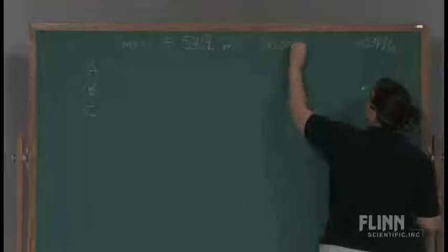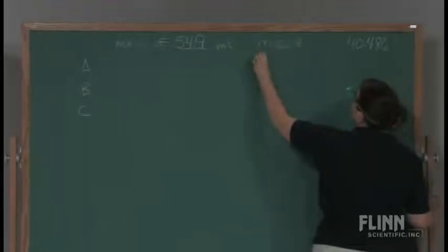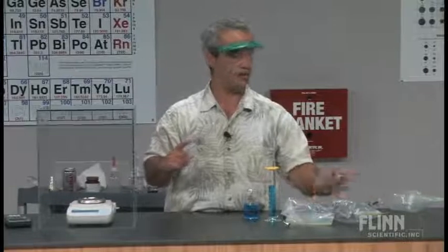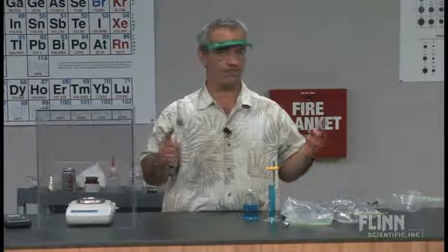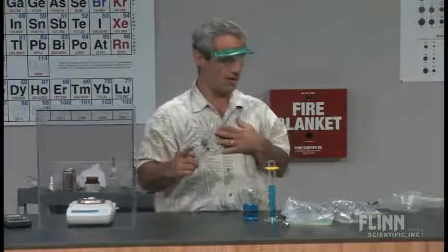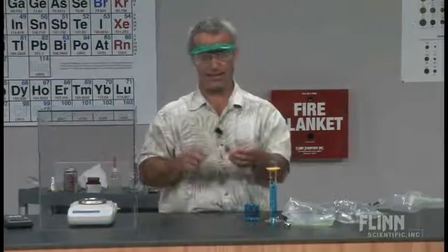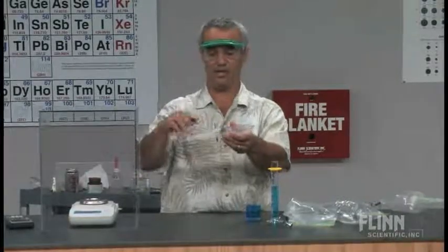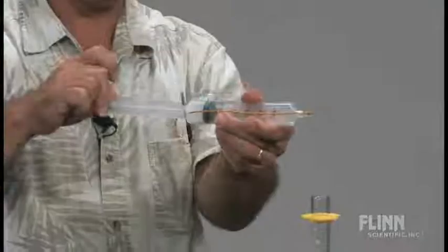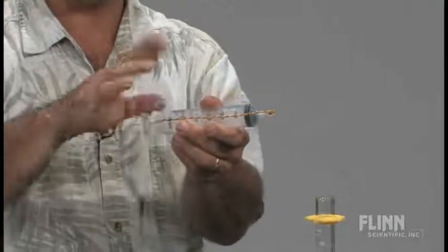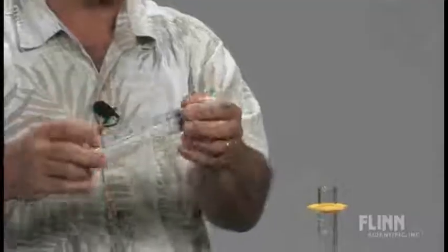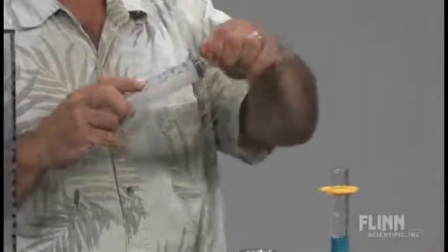Now I'm going to put one of these gas samples in here. I've got three gas samples: A, B, and C. Those are my three unknowns. One of them corresponds to carbon dioxide, one corresponds to air, and one corresponds to methane, which I got right out of the methane gas jet there. So we'll get rid of the vacuum. That's good to do to make sure it didn't leak while you were doing that. We'll try putting some of gas sample A in there.